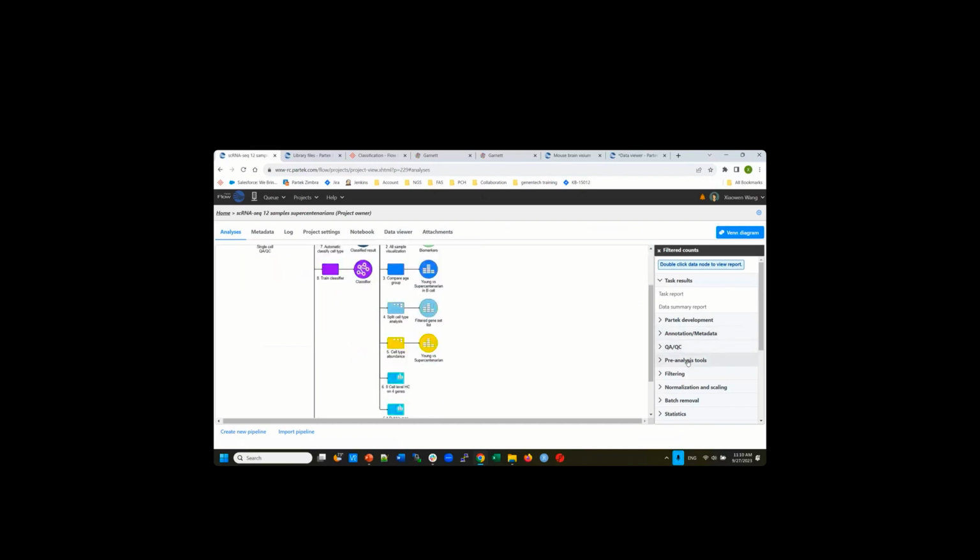And then you choose pseudobulk under pre-analysis tools. Basically it aggregates cells into some kind of group, and you define what the group is. You can use multiple ways to identify it. So for example, I just want to look at each sample. If you do it this way, I will use the sum. What's happening is that it's almost like I pull the data back to the bulk level and put all the different cell types into my sample. I want to look at how the data looks at a sample level.